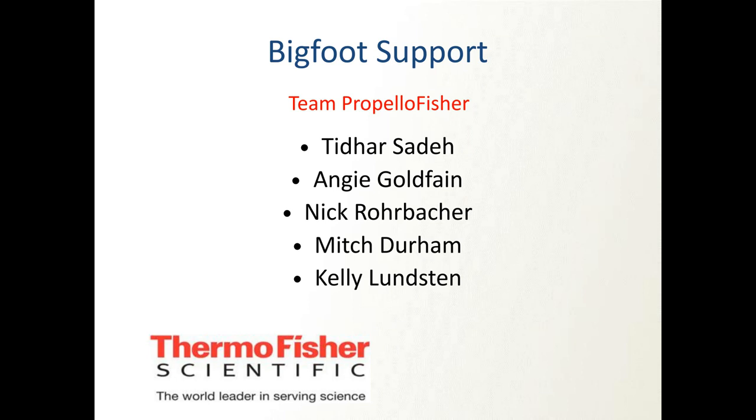So there's going to be a lot of work done, and unfortunately, I'm not capable of doing it all. I know other people are ramping up to where we are right now. There's going to be panel design optimization for the Bigfoot. Right now everything's optimized for the Cytek, and we've been trying to walk in those same footprints, and it's just not quite the same. So the work for people who want to do big sorting on the Bigfoot is figuring out where the commonality splits and what reagents are better biased towards the sorter platform.